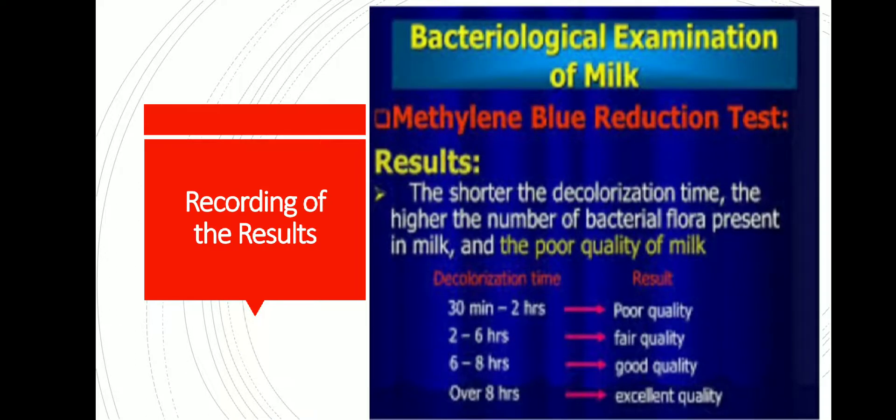The results are recorded in the decolorization time. The decolorization time if it is between 30 minutes to 2 hours, this is poor quality of the milk.